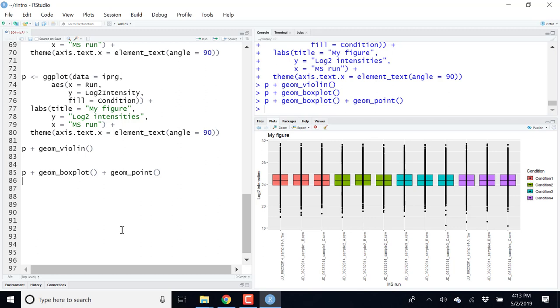So I have my box plots, and on top of these box plots, I have the individual points for all my intensities for run 1, run 2, my second and third run, and so on. These points are perfectly aligned on these individual lines. This is not really useful, because given that all these points are aligned, it's quite difficult to know if I have more points here than there. And we know we have more points here, we see this from the distribution.